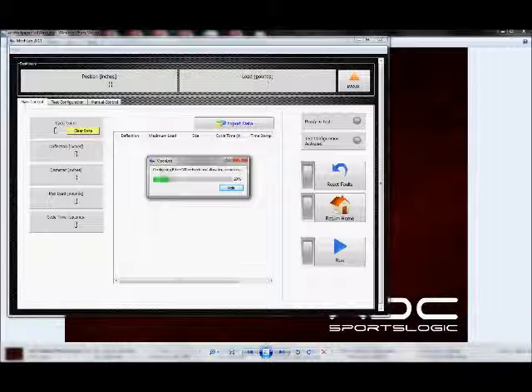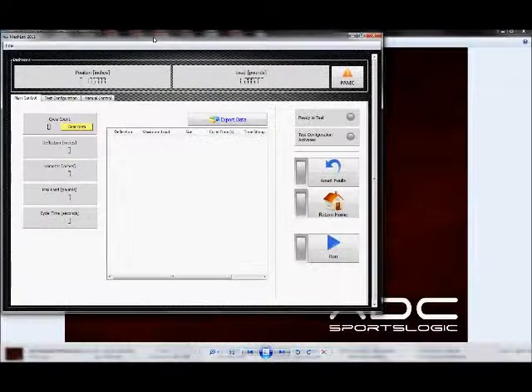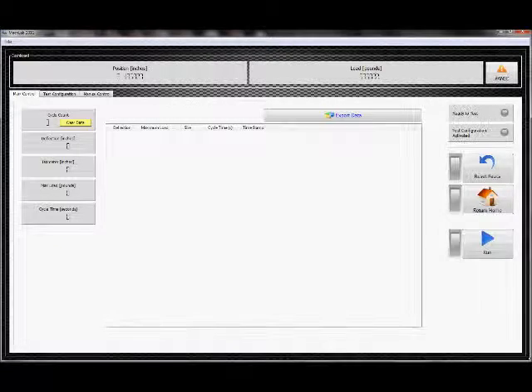And what we see here is just the software going out and talking to the machine. It has to go and configure the components, so there is a little bit of a startup time. The box you saw can be hidden from view, so you can do things like change settings or load configurations while it's doing that. It won't affect the operation of the machine. If you hide it, it's still going to try and connect. Can't hurt it by hiding it.